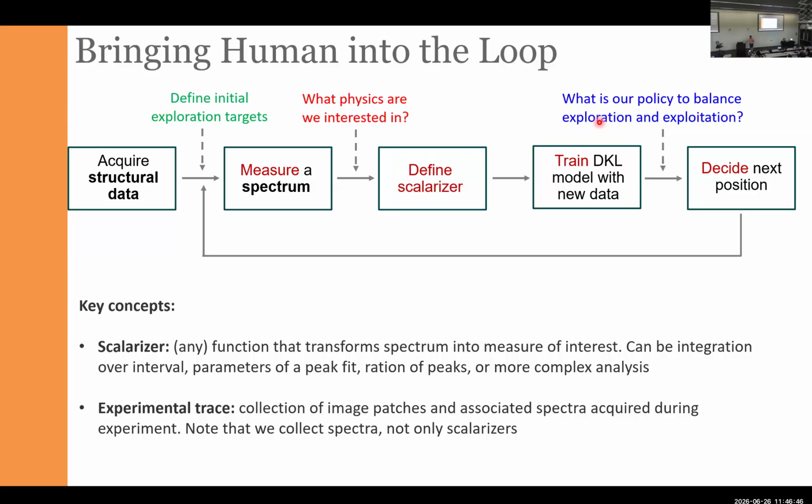Until now, all the experiments that we are running for microscopies are human-driven. As a result, everybody who runs the microscope, meaning human operators, has the culture of deciding whether they're measuring interesting things or not. So we always have the human baseline and human comparison. The only thing about machine learning is that it can work much faster, which means that the human does not assess the result of a single step done by machine learning algorithms. The human assesses the results of 100 steps done by machine learning.